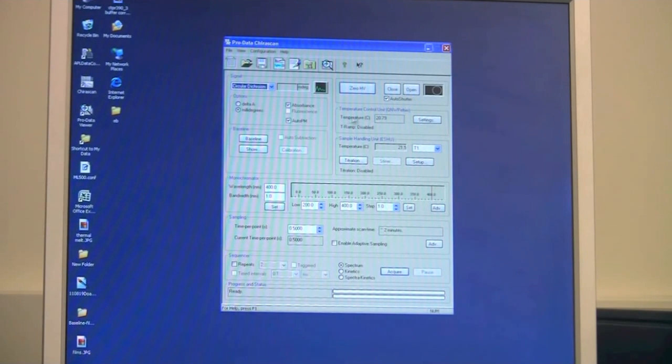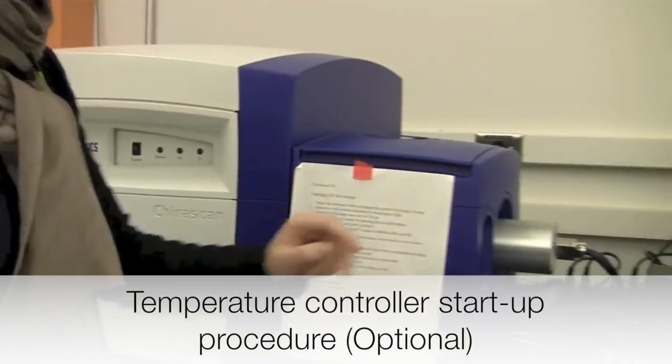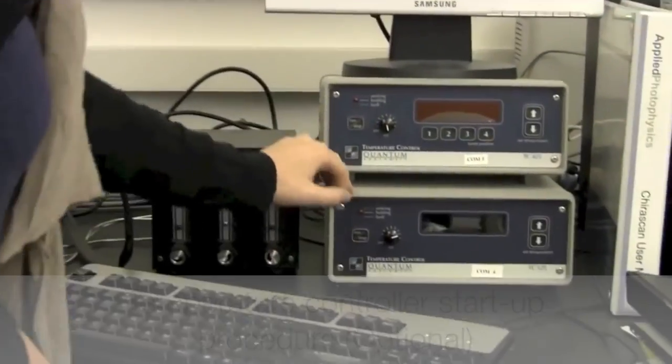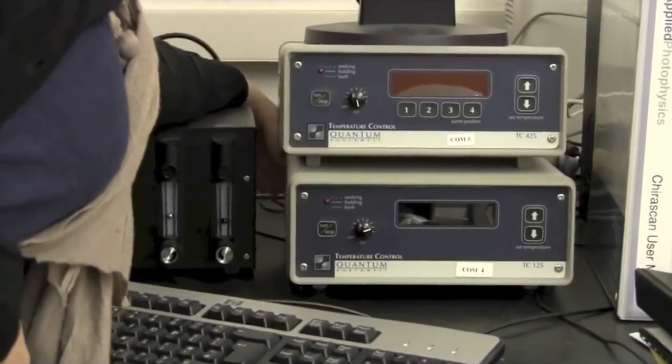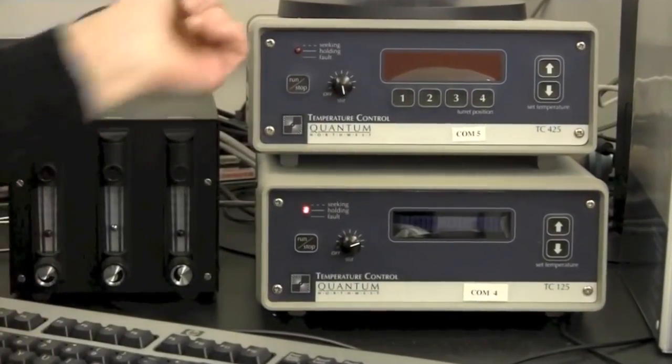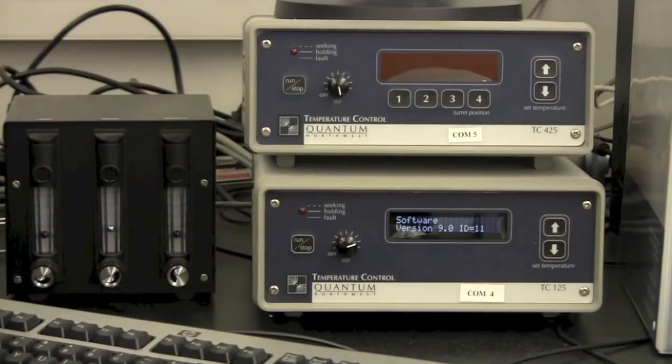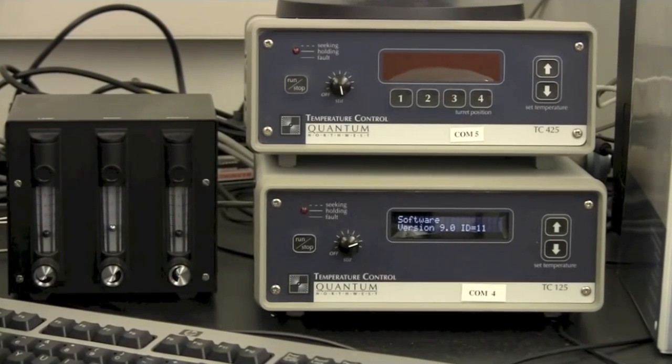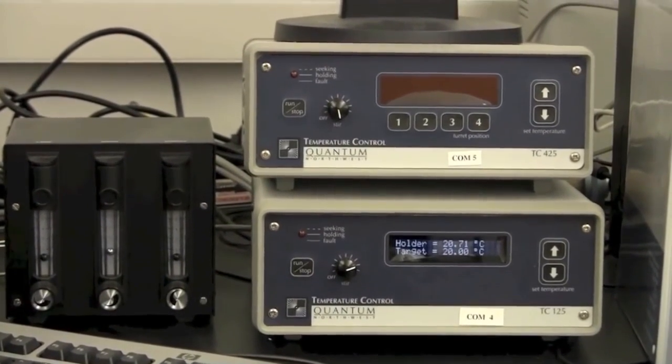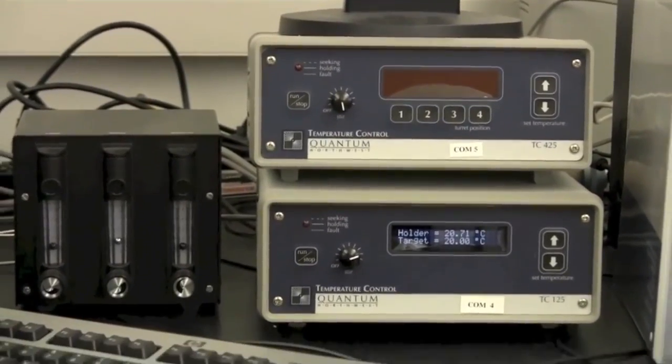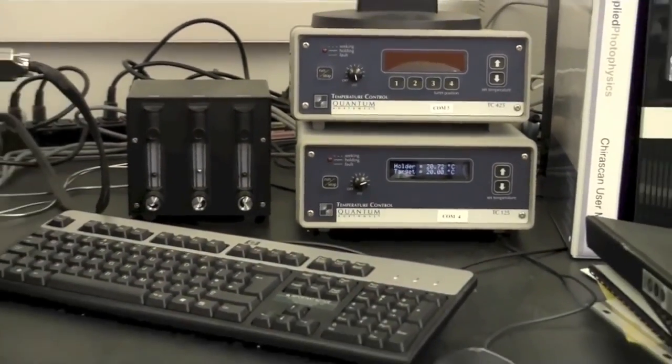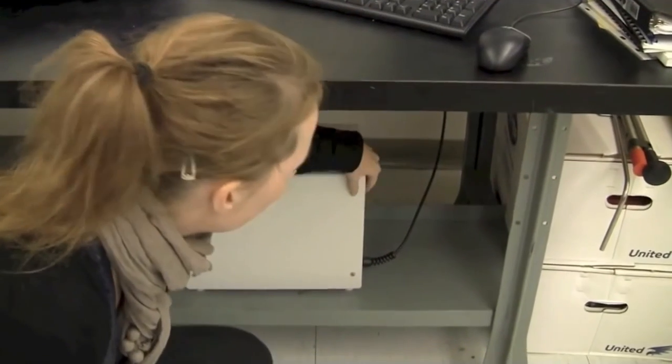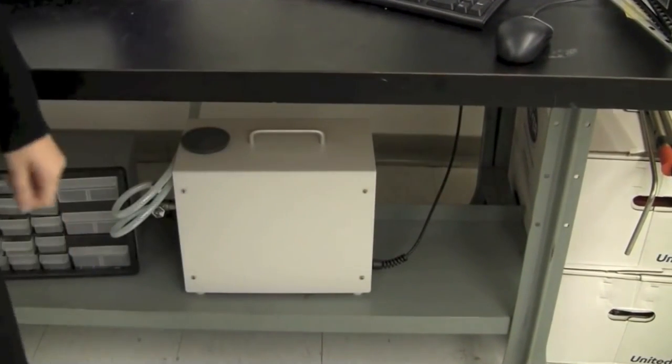Then you have a temperature control area here. I will turn on the temperature controller down here which is done on the back. When you have the temperature controller on, because it's heating your sample inside here, you always have to turn on the water circulator so that you don't overheat the system. The water circulator is down here and it's just one click on the back like that.